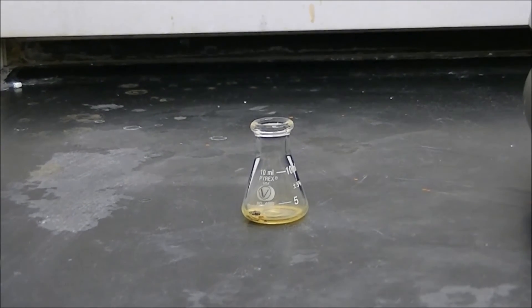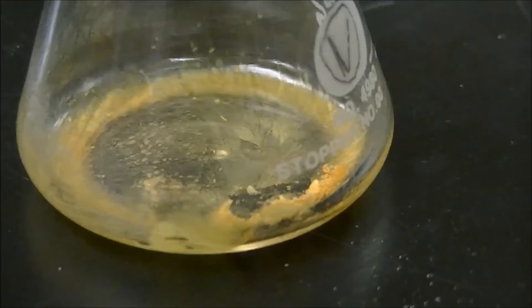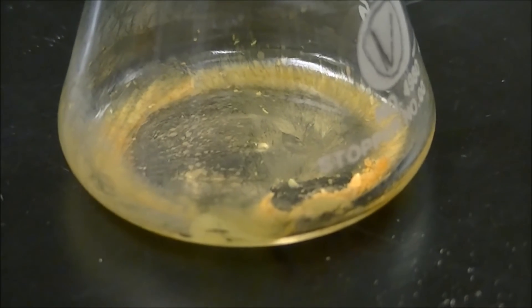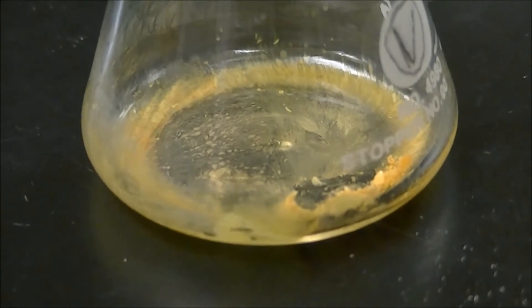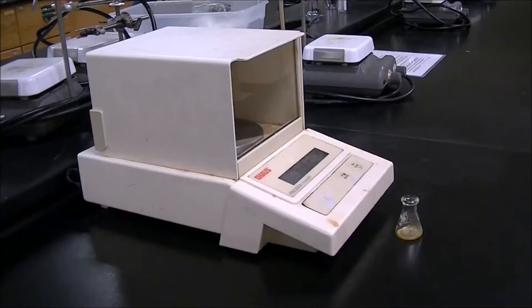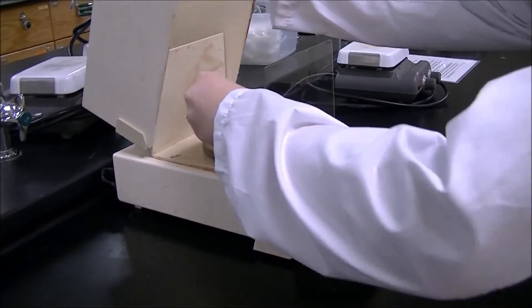Once it's done boiling, remove the flask from the hot plate and allow it to cool to room temperature. Here you can see that once the 9-fluorenone solution has gotten to room temperature, it becomes a solid. Weigh and record the mass of the 9-fluorenone and the Erlenmeyer flask.